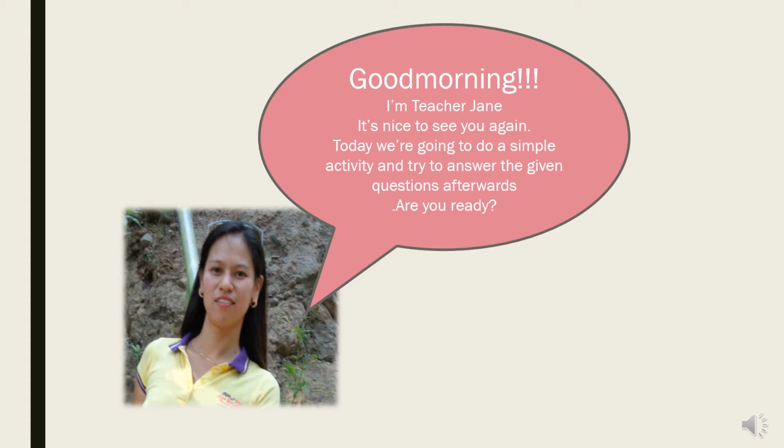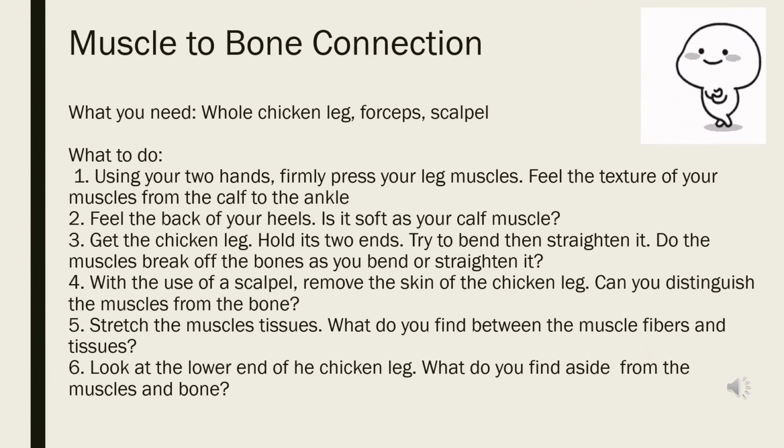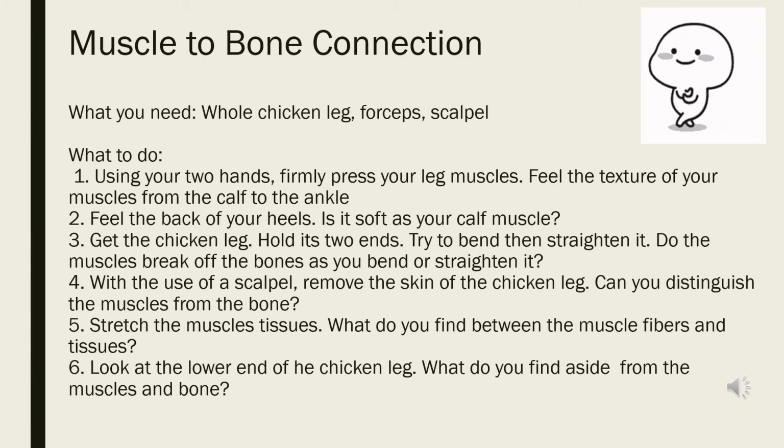Today, we're going to do a simple activity and try to answer the given questions afterwards. Are you ready? Okay, let us begin. Okay, so we're going to find out the muscle to bone connection. What you need: you have to prepare a whole chicken leg, forceps, and scalpel.